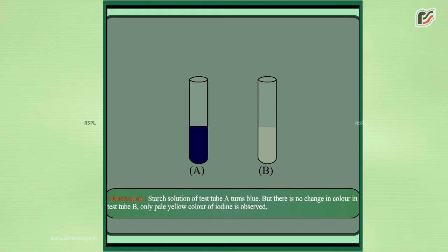Observation: Starch solution of test tube A turns blue. But there is no change in colour in test tube B. Only pale yellow colour of iodine is observed.